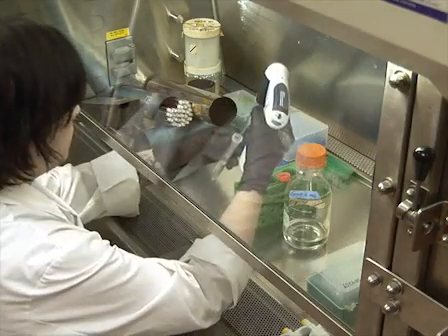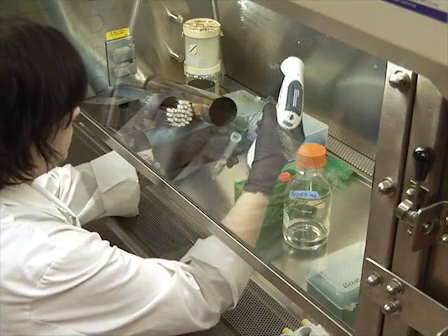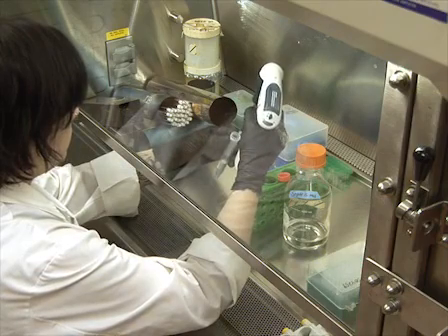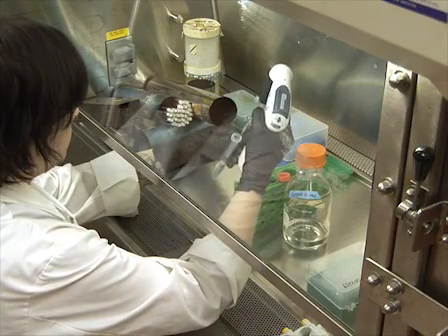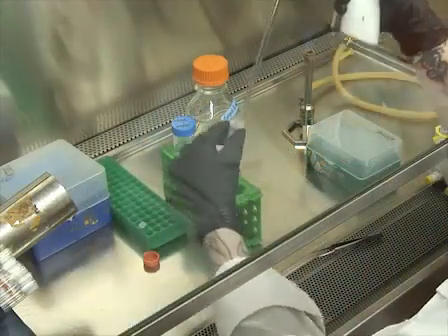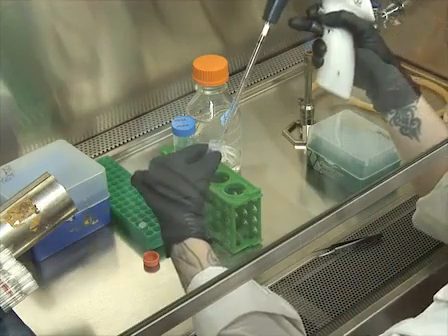Use a Pasteur pipette and triturate the sample to further dissociate the tissue. Keep triturating until the pieces of tissue no longer get smaller. At this point, pellet the cells again. Remove the PBS and resuspend the pellet in 3 milliliters of maintenance medium.